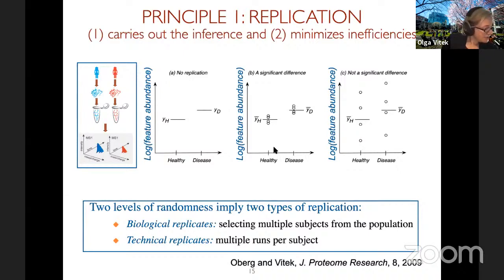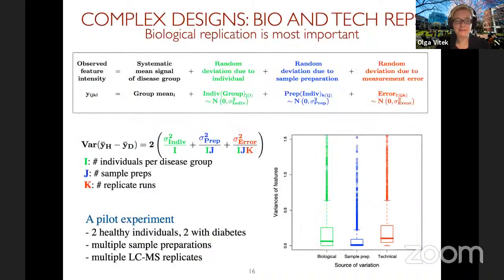The question about the random sample of individuals, is it a complete randomization or a simple randomization? I don't know what's the difference between complete randomization and simple randomization, but hold that thought, because hopefully the next few slides will clarify some of that. Okay, so for the moment, we're saying that we just randomly select subjects from the population and randomly allocate them to all the steps of data processing.